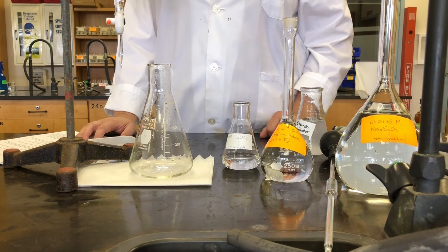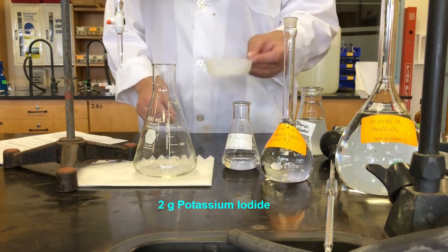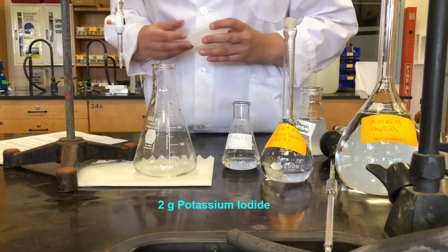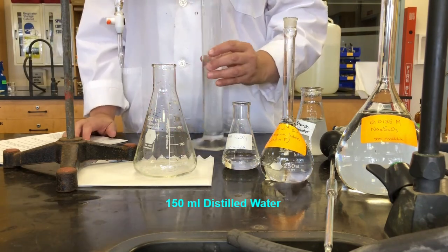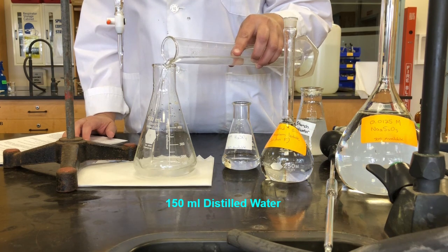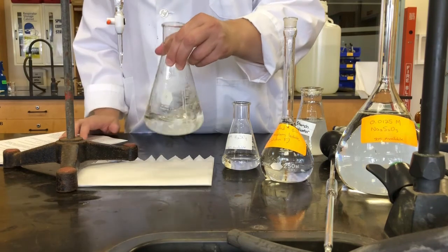So to do that, we're going to use this Erlenmeyer flask, or a conical flask. We're going to add to it, first of all, 2 grams of potassium iodide. So I have 2 grams of potassium iodide already weighed out here. I'm going to add that to the flask. Okay. Now we're going to add 150 milliliters of distilled water. So I've already filled that up in our graduated cylinder to 150 milliliters of distilled water. So we're going to add that to our potassium iodide in the flask. Just make sure that's dissolved.